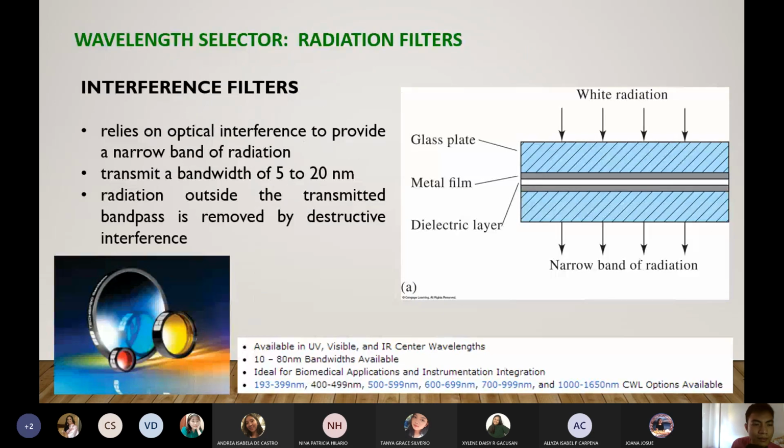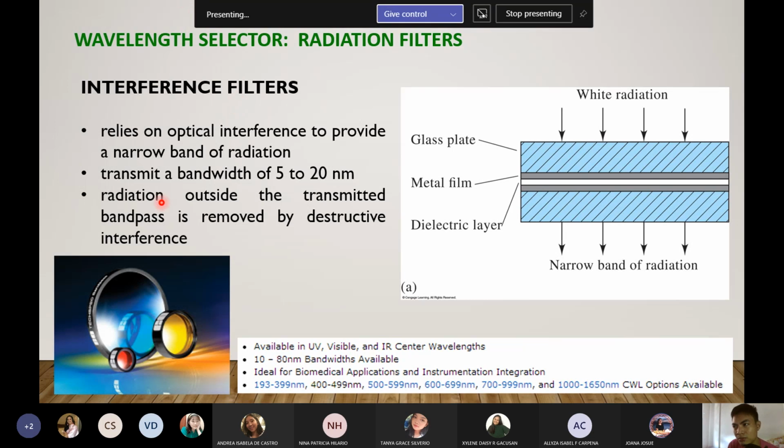Okay. Sometimes gumagamit din tayo ng filters, no? The purpose of the filter is to minimize interferences, no? Okay? Ito na kwento natin last time, chapter 2, ano yung interference. Pag sinabing interferences, these are things that cause error in our measurement, no? So since ang usapan natin dito ay light, no? Maraming interference sa light, no? Pwedeng stray light, no? Yung liwanag ng paligid makaapekto sa measurement mo.